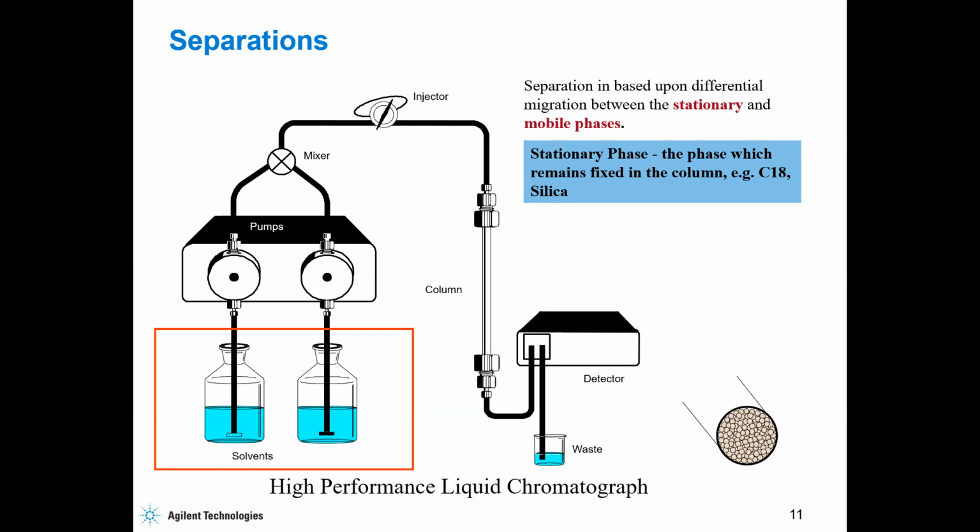But let's say once my analyte gets to the detector and I can see a chromatogram, once it gets into the detector, it goes into the waste. Let's say I have a mixture of 3 components and I inject. After 5 minutes, component 1 comes out. After 10 minutes, component 2 comes out. After 15 minutes, component 3 comes out.